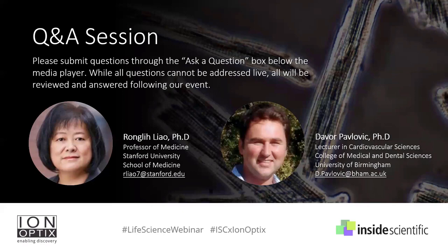So I just want to highlight that to make sure the cell is in good shape before you proceed with any of your planned experiments. And you really take time to learn and master the technique. And I think patience is a virtue. So be patient and practice makes perfect.